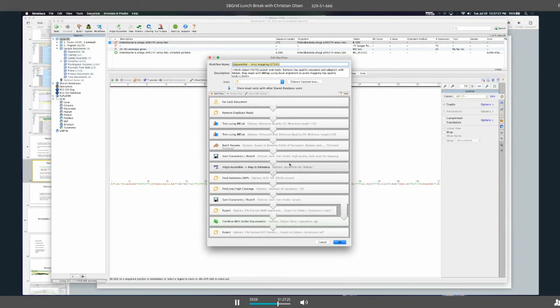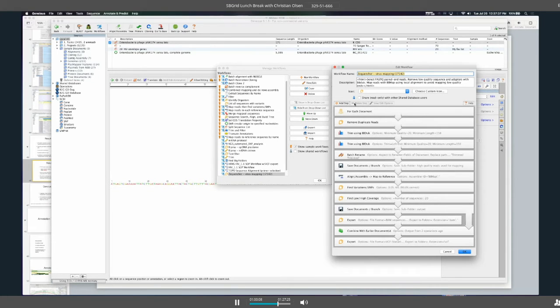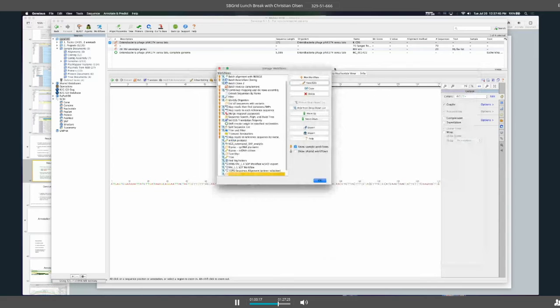And just to bend your mind a little bit, you can nest workflows within workflows. Okay, so when you do that, I recommend you do that with a colleague. That'll prevent you from losing your mind. That's when it gets a little strange. But at each step, double click on the step, and that will give you the parameters for the step. So it's rather trivial to navigate.